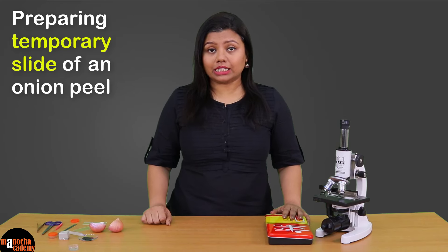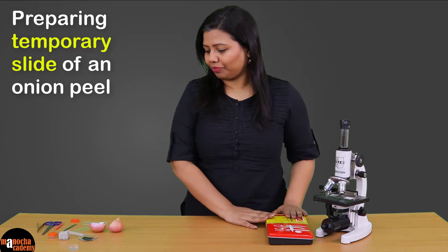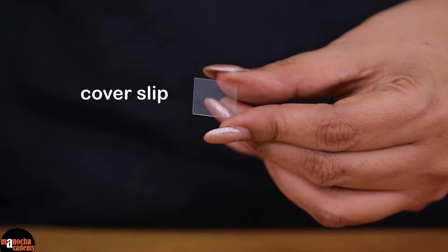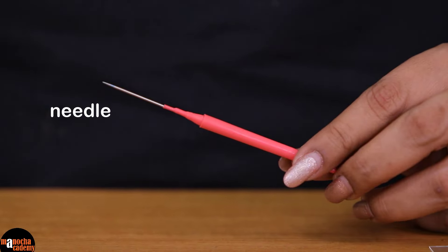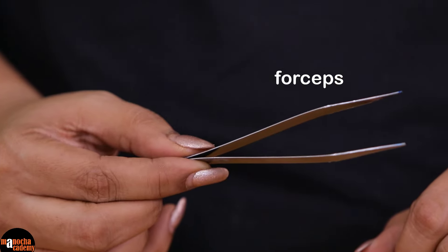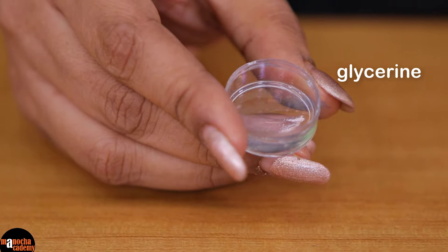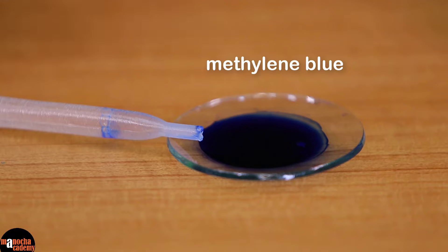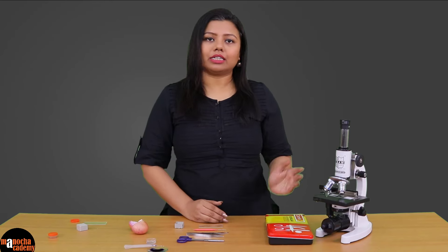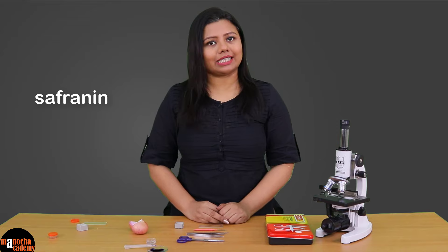For that, these are the following things that you would require from your dissection box: clean glass slides, cover slips, needle, a scalpel, forceps, a pair of scissors, onions, a little bit of glycerine, and I am using methylene blue stain to stain the slide. You may use safranin or any other stain that is available.